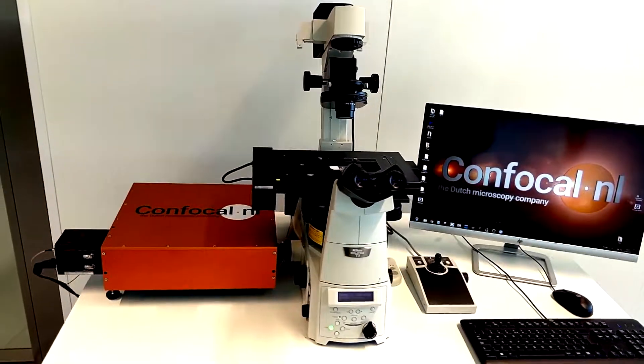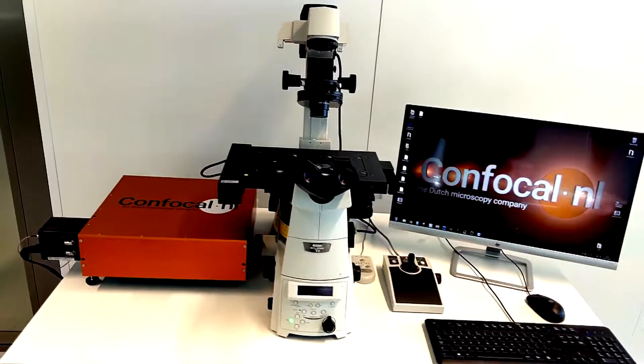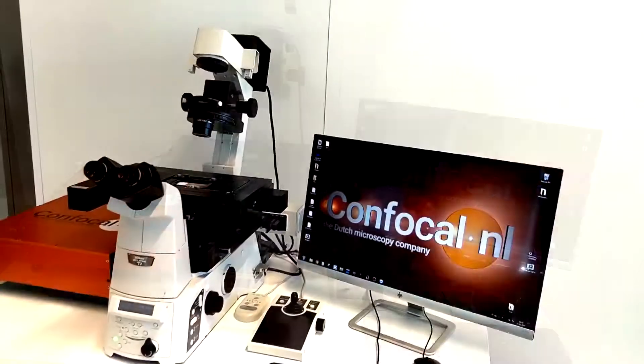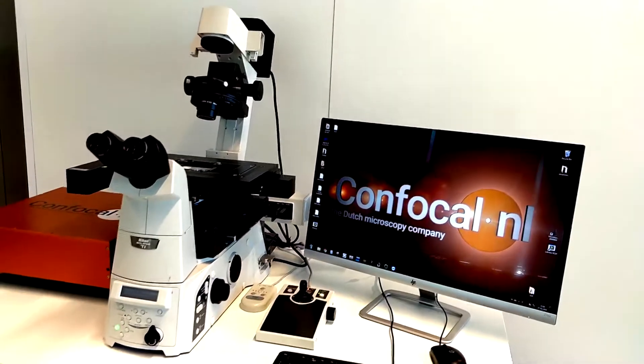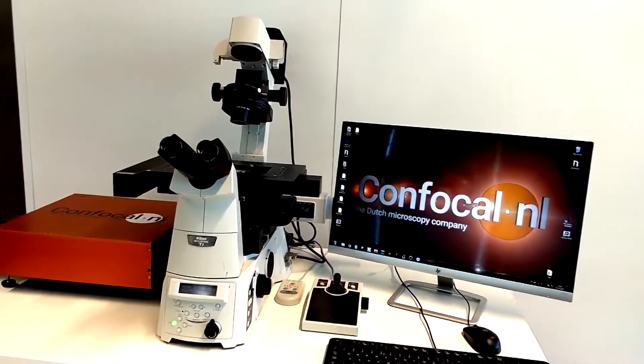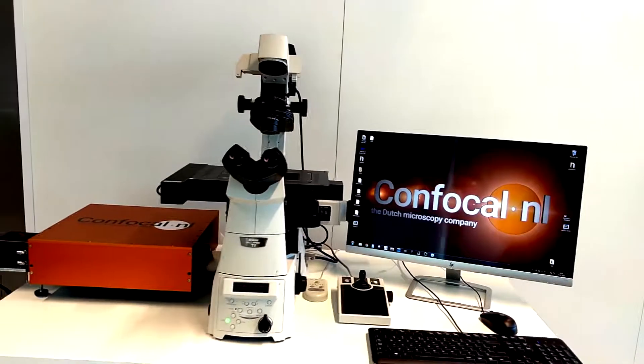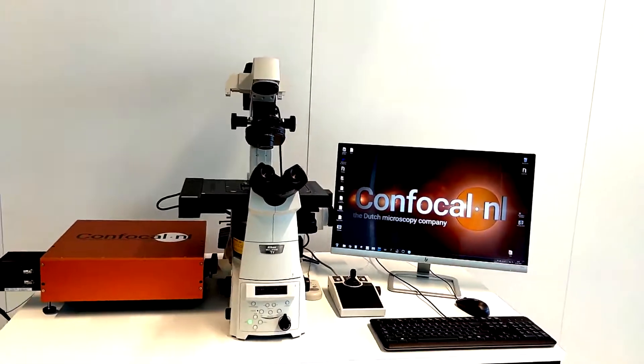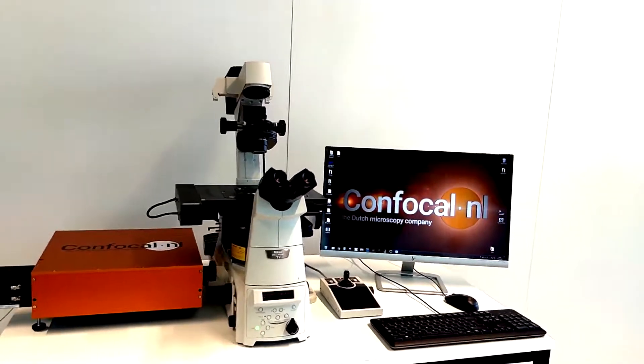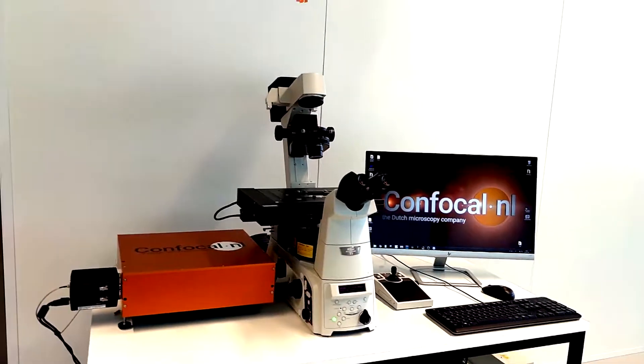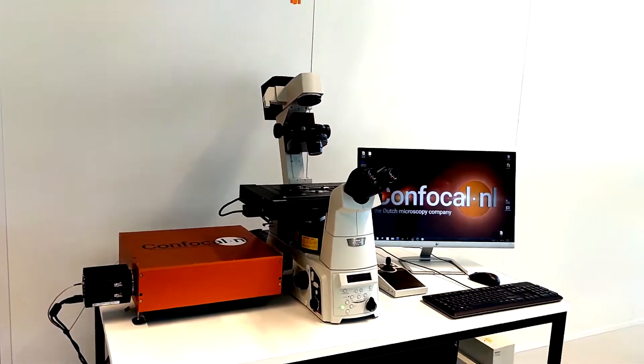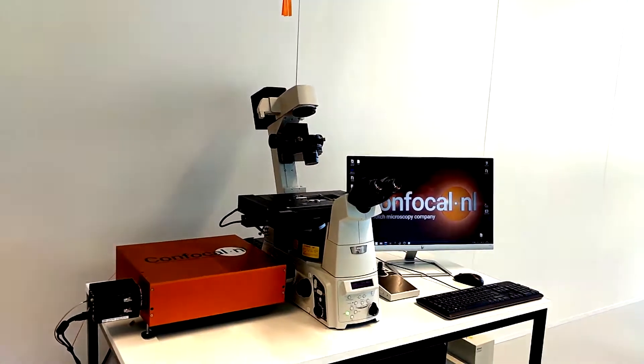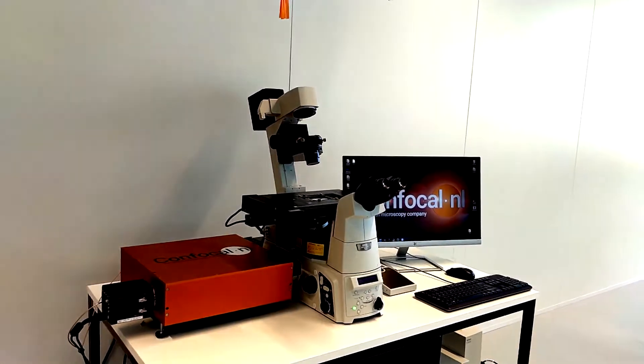Micromanager supports multiple platforms, Windows, Mac and Linux, and provides an open plug-in interface for adding new devices. Combined with ImageJ, Micromanager provides a full-featured microscope management and image processing package, comparable in capabilities to commercial solutions. It is distributed free of charge and under an open source license.